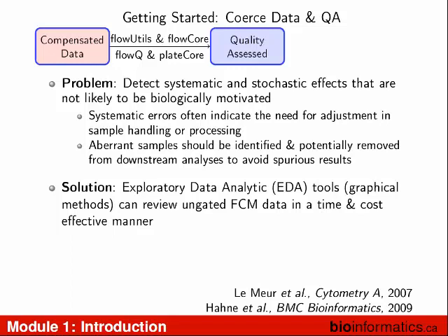They knew that happened on the machine, but we didn't, because here's our data analyzer, right? All this extra information that was in their head doesn't get put in the FCS file. Again, metadata annotation is really important. All of a sudden, these populations are moving around because of this laser change. And these populations moving around is a difference, but we didn't know that difference was based on time, and that time was the laser swap. So we saw this difference, but we didn't know what it was.